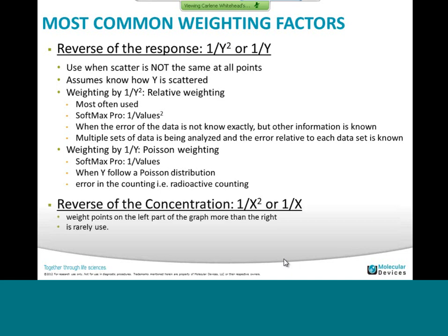Then the reverse of the concentration, so 1 divided by the concentration squared, or 1 divided by the concentration. It will weight the points on the left part of the graph more than on the right, and therefore it is very rarely used.